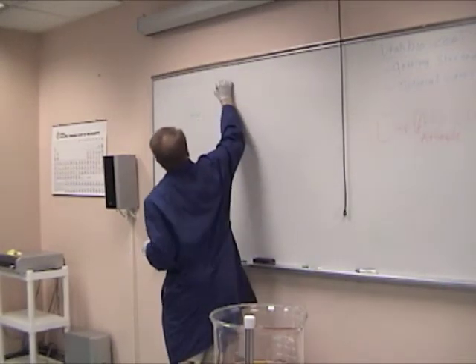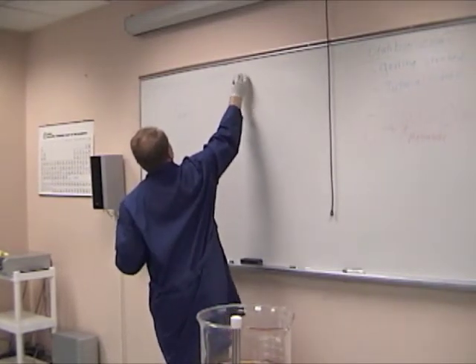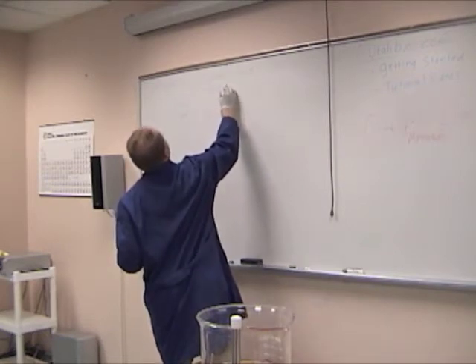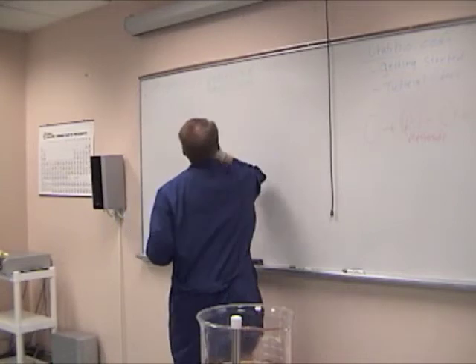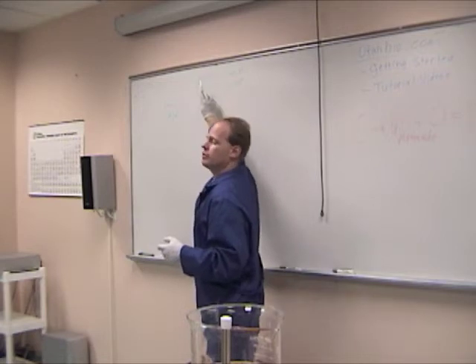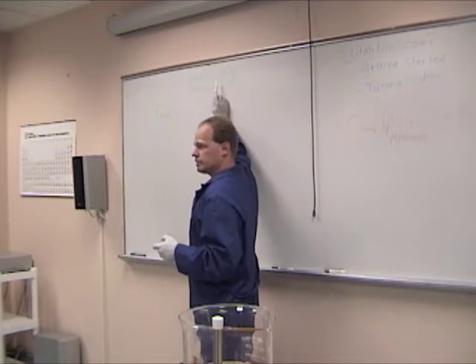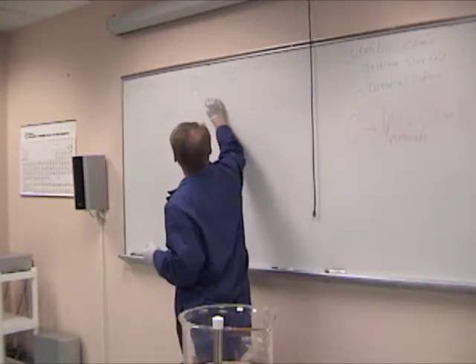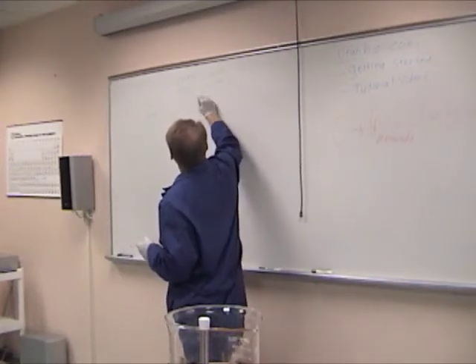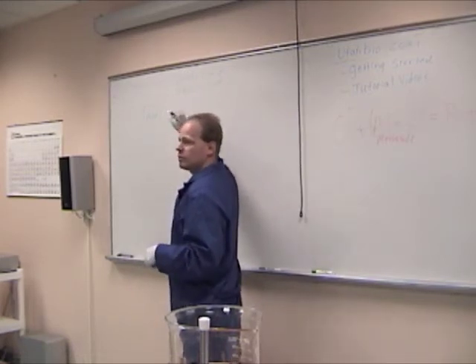Well, if you remember, oil plus methanol plus catalyst equals biodiesel, but free fatty acid plus catalyst equals soap. The problem is that the free fatty acids will attack the catalyst before the oil and the methanol, so you'll get soap before you'll get biodiesel. So our goal is to figure out how much of these are in there so that we can add enough catalyst to make the biodiesel plus more to fully neutralize those acids. That's all we're doing when we're doing a titration.